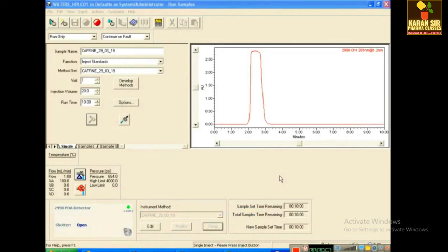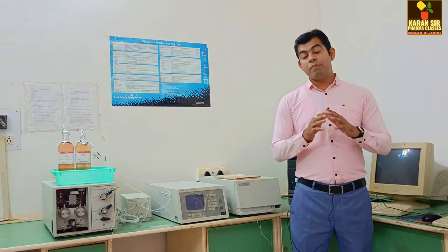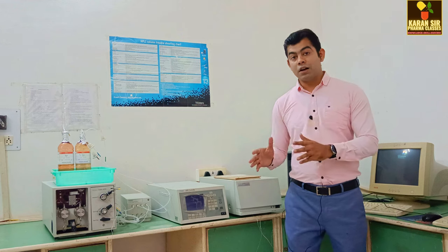It is very important. The pressure must be stable and the column must be pure and in a proper manner. So you will get a proper peak or sharp peak. So our sample run is completed. In this video, I will show you how to integrate the peak and how to make a report. One more important thing, the concentration of a drug is calculated by its area under the curve in HPLC. So do not waste time and let's go to the computer screen.